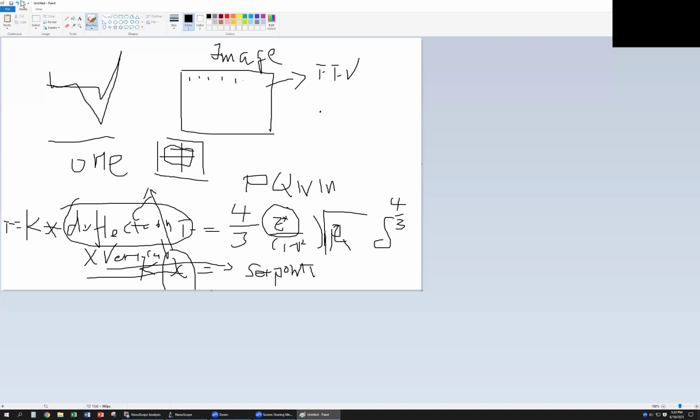The one here is a simple one, 2.5. The Young's modulus is 2.5 megapascal. Then the second one is 3.5. Then this third one is 2.7 gigapascal. Then this one is 72 gigapascal. So that's for different kinds of samples. We should use the different standard samples to calibrate this value. Okay, we calibrate with this R.